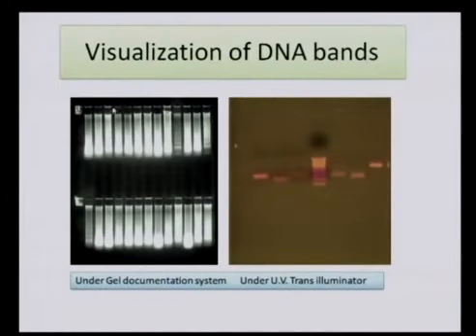On the top side of the gel you can notice the wells, and these are the wells where we are going to load the DNA sample. Here also you can see the wells. On the right side, the gel is the one which we obtained under a UV transilluminator.